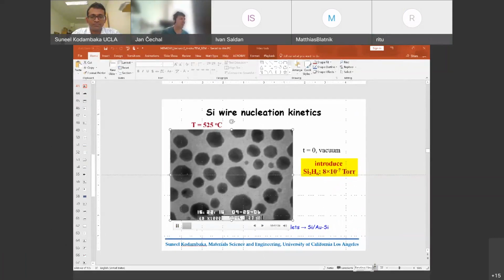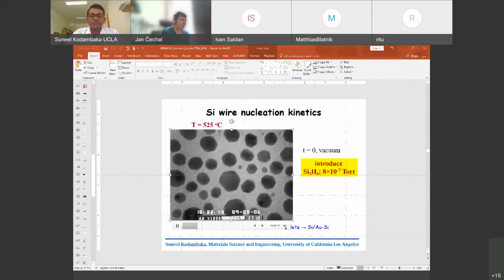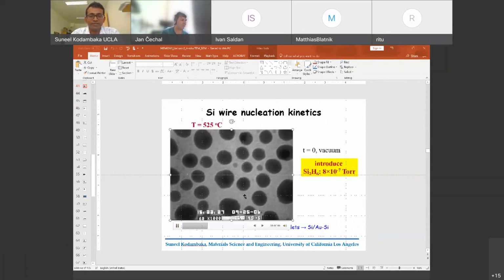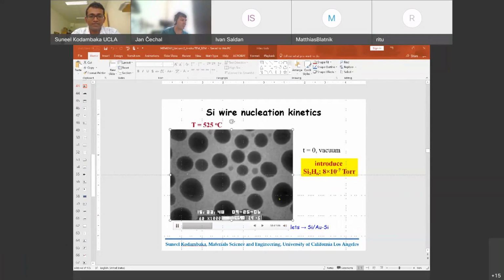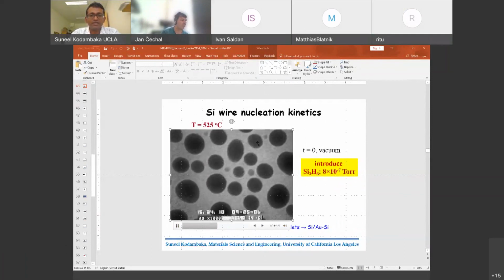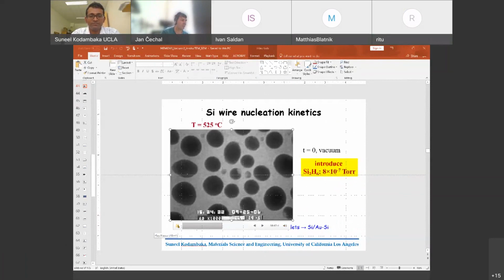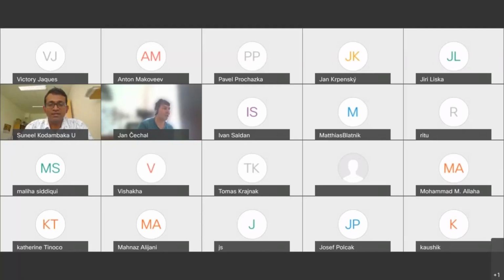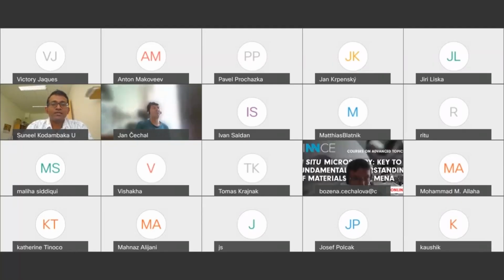Okay. So here, initially, these are all well separated. And now you have silicon being deposited on the grid. And now you see this jumping. Is that what you're referring to? Yes, sudden jumping and absorbing stuff. Yes. So it's a plan view membrane. Initially, it's silicon nitride, and the islands are isolated. These gold crystals are isolated from each other.